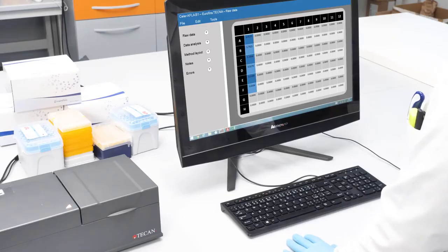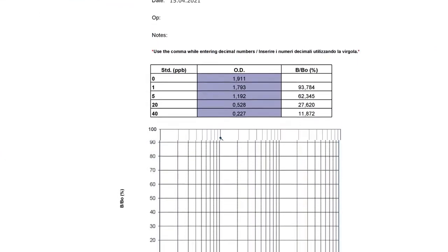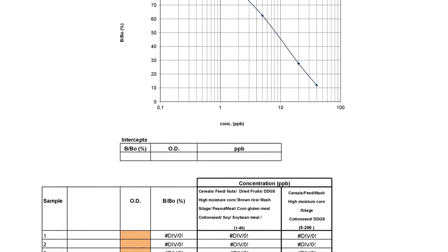Download from our website the dedicated spreadsheet. Copy the absorbances measured for each standard in the upper part of the Excel and those of the samples in the dedicated table.